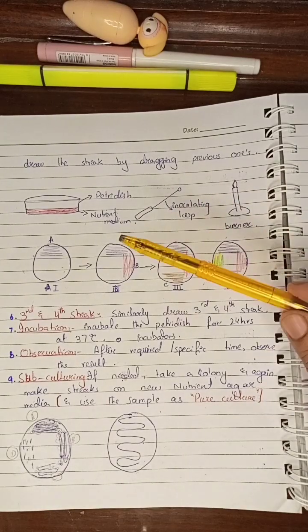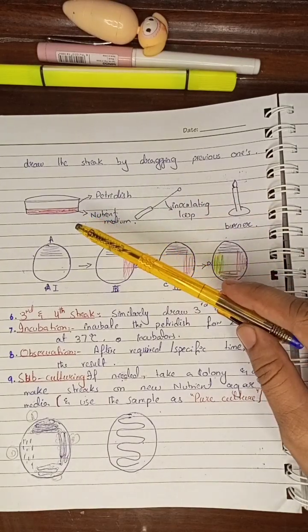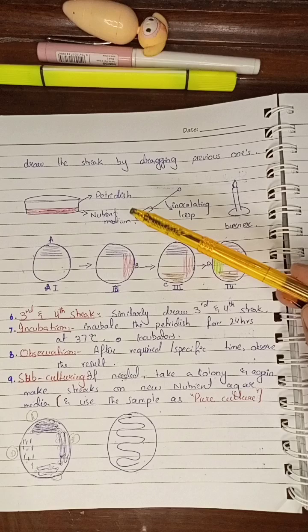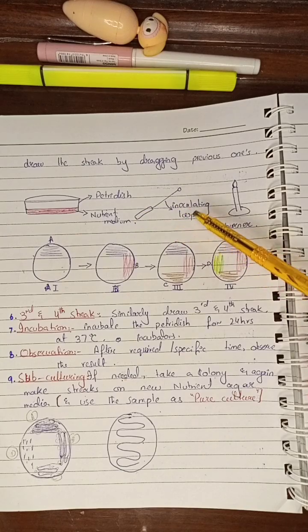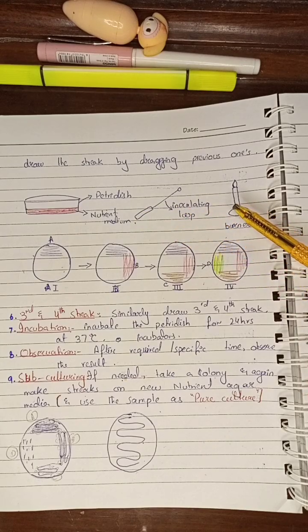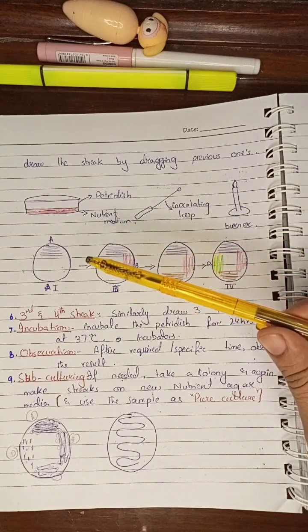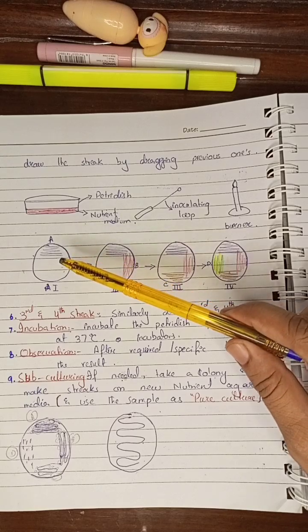In this method, prepare the nutrient medium and pour it in the petri dish. Allow it to solidify, then take the inoculating loop and make it red hot. After cooling for 3 to 5 seconds, make a streak in this pattern.